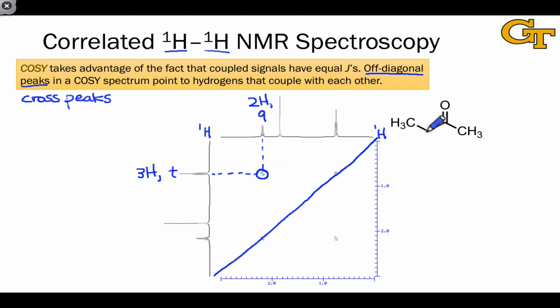Looking at the structure corresponding to this spectrum, methyl ethyl ketone, we can see exactly how this splitting pattern arises. These two protons are split by three adjacent methyl protons, which is why they're associated with the quartet splitting pattern and of course they give rise to an integration of two. The methyl protons on the other hand get split by the two adjacent CH2 protons, and so they display as a triplet and of course integrate to three. One thing to notice is that this methyl peak is associated with no cross peaks. There's nothing in its path if we drop a line from that peak down onto the diagonal. This tells us that those protons do not engage in coupling, a conclusion that we could have come to by virtue of the fact that it's a singlet anyway, but nonetheless we can see what this looks like on a COSY spectrum. No cross peaks, no matter how we drop a line to the diagonal, either vertically as shown initially or horizontally.